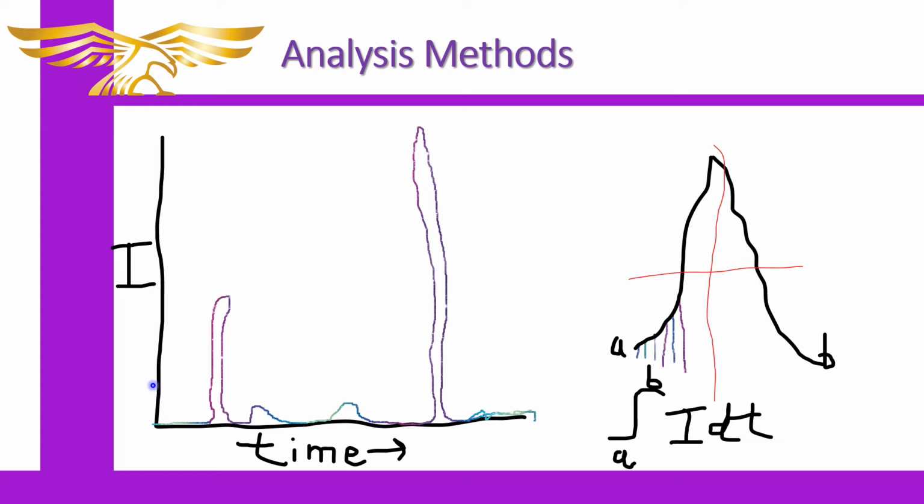But essentially, you just want to look at this line here as if it's an intensity from an instrument. It's some sort of reading the instrument's giving, and it's just plotting it here. There's not really necessarily a unit that's always associated with this. It's just kind of an intensity. And then the time is what would be on your x-axis. So you're looking at it as it crosses over across time.